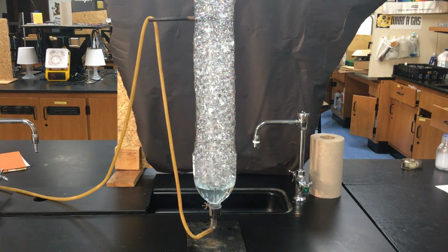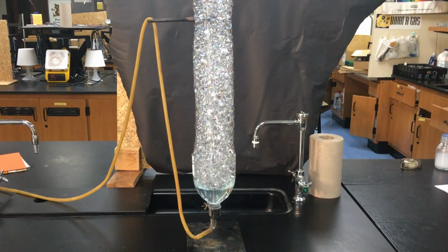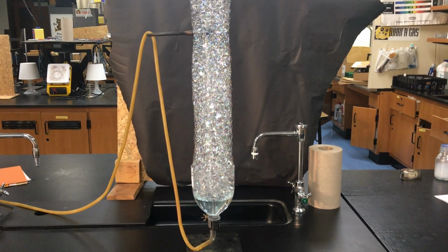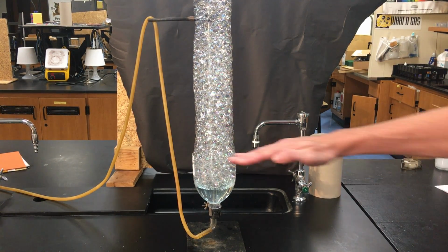Well, some of the physical properties of methane: it is clear, because in fact, all gases are clear. It's also colorless. There's no color in it. Some gases are colored. But an interesting property is that these soap bubbles are rising up, which shows us that methane is less dense than the surrounding air. In fact, if I do a little karate chop, you can see that the gas bubbles kind of float up to the ceiling because methane is less dense than the surrounding air.